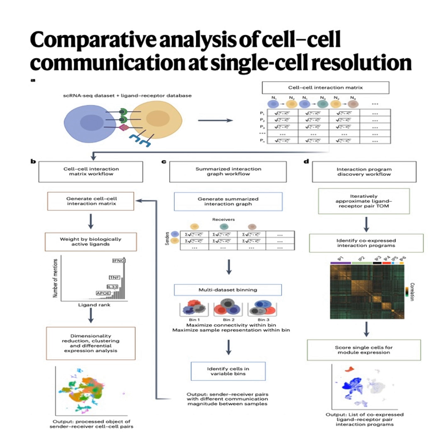So wrapping this up, what's the big takeaway for someone listening? Why does this single-cell approach with Scriabin matter? I think the main message is that Scriabin, by preserving that single-cell view, gives us this incredibly powerful magnifying glass. It lets us see the intricate structure of how cells organize and influence each other in their niches, finding biological signals that are just fundamentally lost when you average things out. It moves beyond just asking which cell type is talking. Right. It lets us ask which specific cells are talking, when are they talking, and what are they saying.